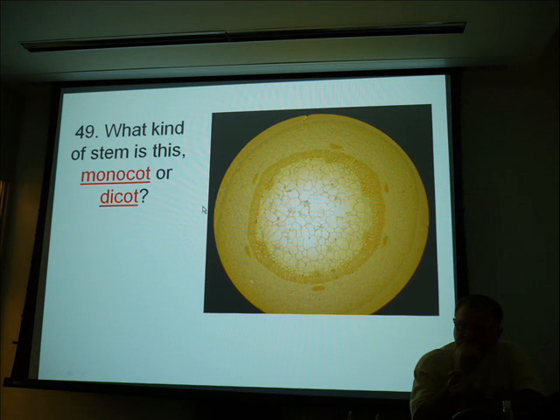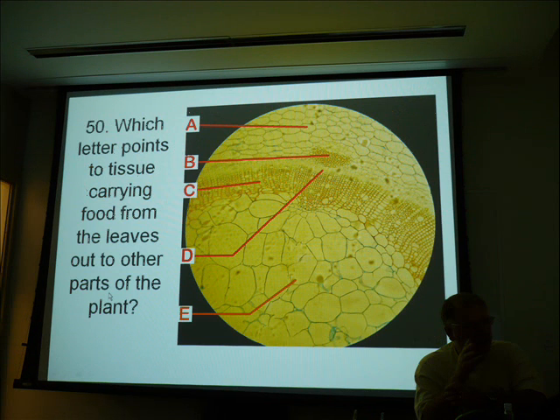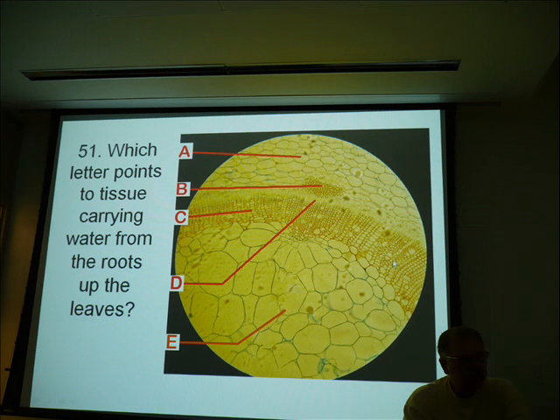All right. What was that one? I see a circle. Now, I blew this one up, I can tell you. So, which tissue is actually carrying food around that plant? This is your food carrier. That's why the food can't get in here. That's why this stuff dies. So which one is your water carrier? All of this, including this, that's your ring of xylem.